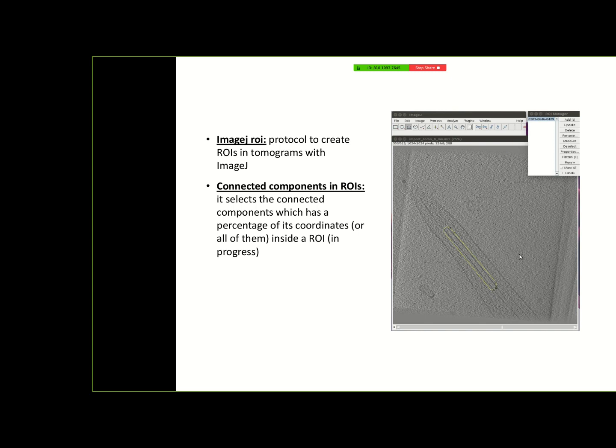And this is a tomogram, so what we are seeing is a slice. So you may go to another slice, and you are not restricted to go to the immediate next slice. You can jump 5 slices in between, draw your region again, jump another 5 slices, draw your region again, and then with all these contours, ImageJ is able to interpolate the slices in between and define a region of interest that is well defined for all the slices.